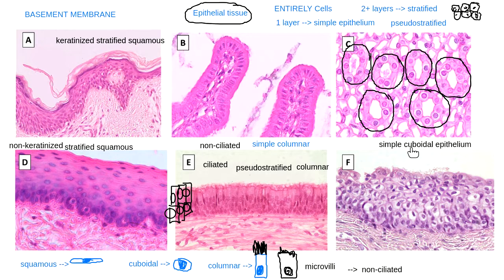Okay, we just have one type of tissue left to recognize on the slide. That is this hot mess down here. Do we have any guesses of what this hot mess is down here? Yeah, so a couple of us are correct. This messy tissue that we're looking at right here, this is called transitional epithelium.